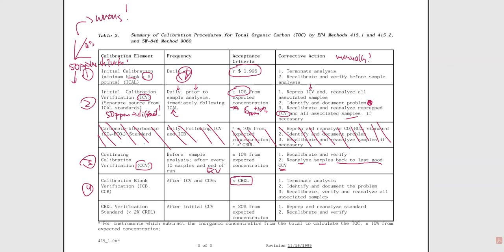So we hope that when we run blanks, aka distilled water, when we place them on the machine, that distilled water could have a value. It could report a number, absolutely. And we want to make sure that the blank is lower than the detection limit that I'm stating that we can go to.